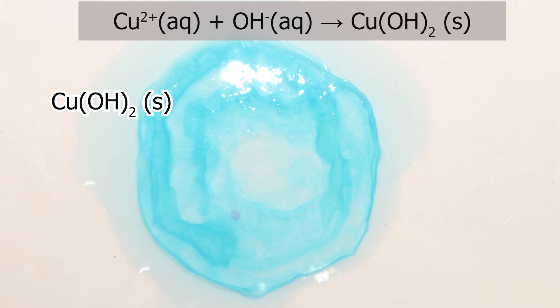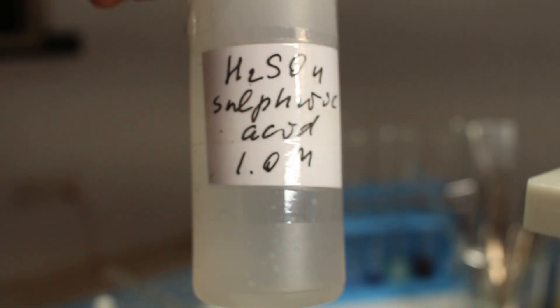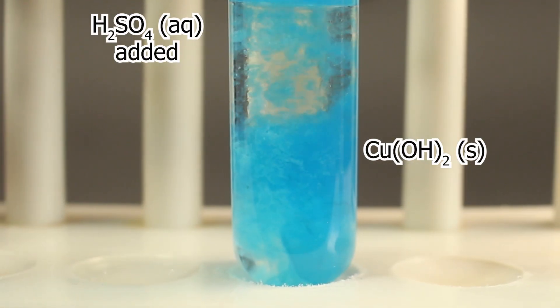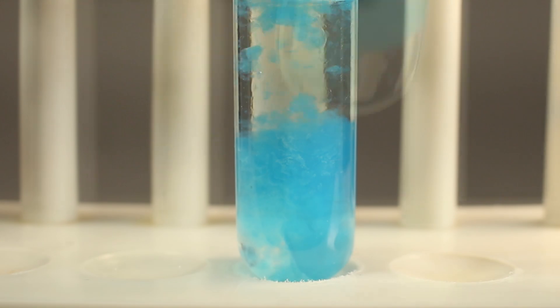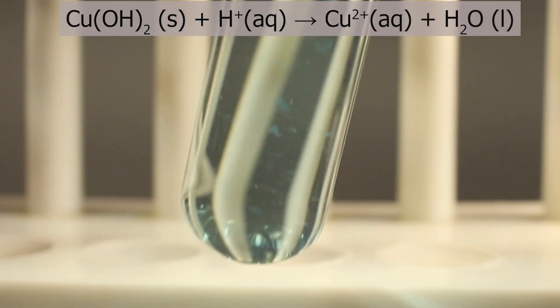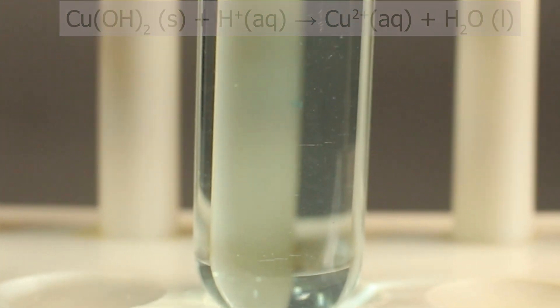Copper ions form insoluble copper II hydroxide in alkaline medium. On addition of acid we reverse the process. Hydrogen ions from acid form water reacting with hydroxide ions, and aqueous copper II ions are back again.